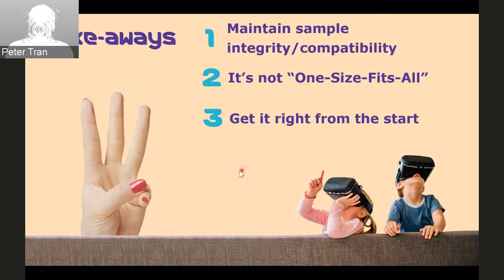If you can get a ton of protein extracted from the sample, then it makes it much easier for downstream analysis. And lastly, just always make your protein happy. Be gentle with the protein and always keep them cold.